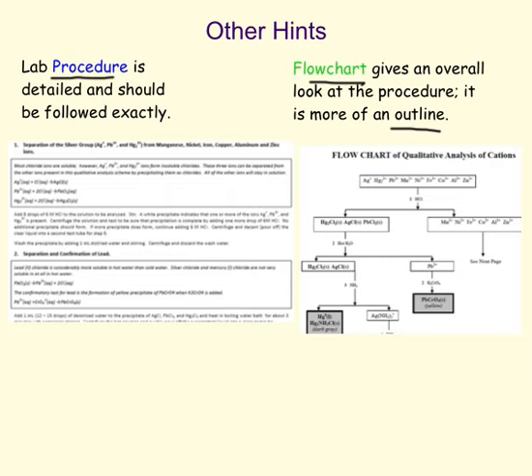So with your detailed lab procedure, you've got some things like reasoning behind things described. Why is it that these things form precipitates? You've got very specific concentrations, I can't really read this here, but in there it tells you 6 molar. It tells you how many drops of things, 8 drops. So you're going to go ahead and read through this very carefully. It'll tell you some things like, hey, once you get it to this point, keep adding a drop until you're sure that precipitation is complete.